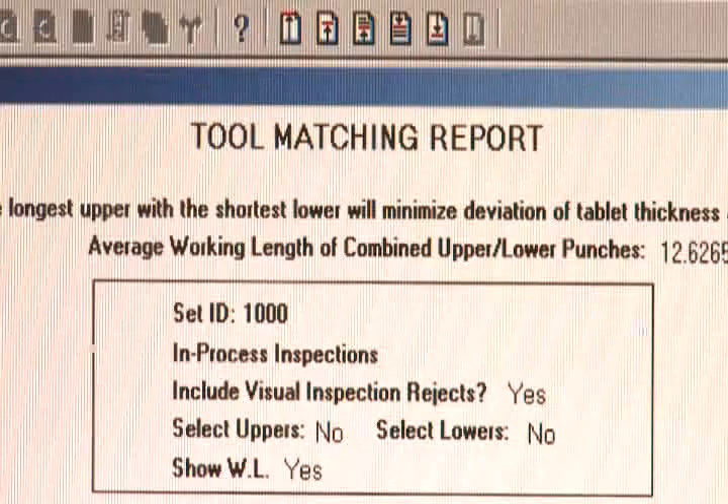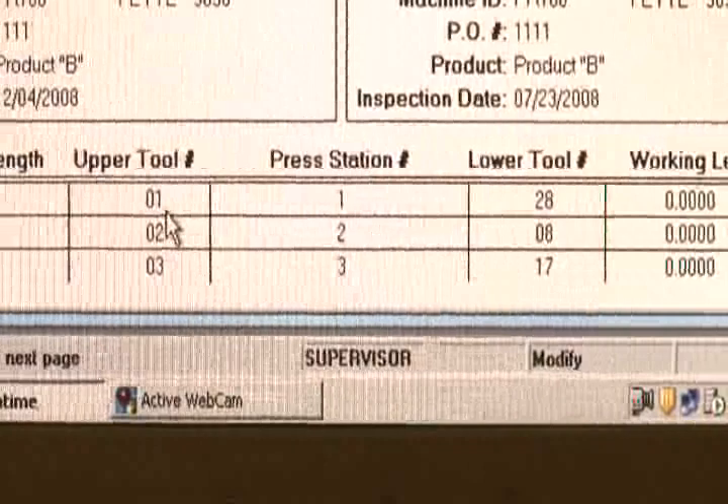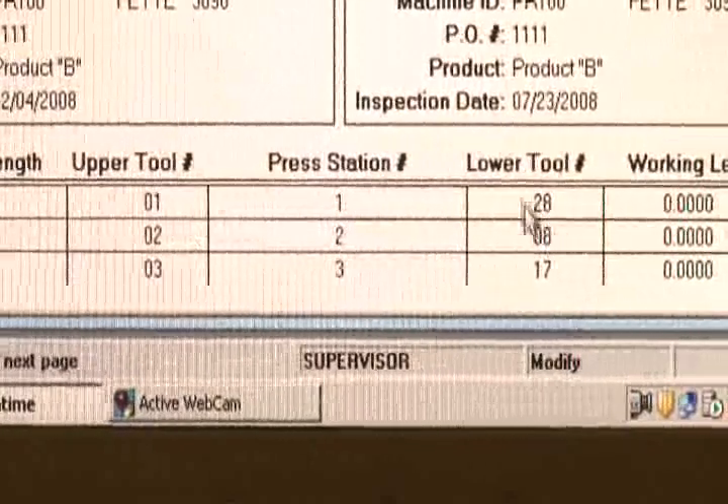The TM2 system also has a punch matching feature for optimum tablet quality and consistency. The importance of matching your upper punches with your lower punches is to minimize the deviation of tablet hardness and thickness.